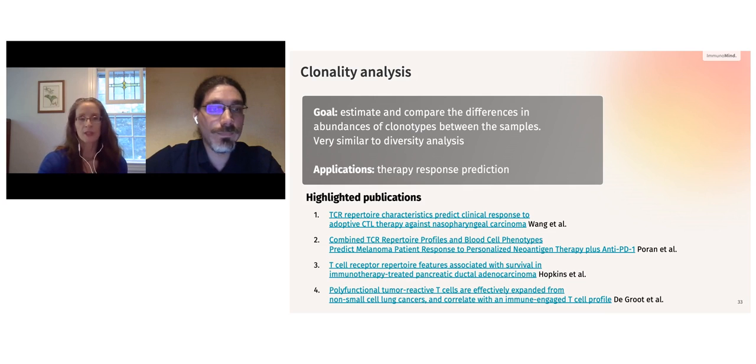What does downsampling do to singletons? Just sample random ones, not considering probability of generation. Right, thank you. So in the repSample function, again, just a reminder, we have a tutorial on it on our website. It is possible to use different methods for downsampling.